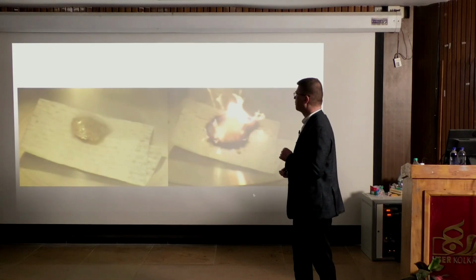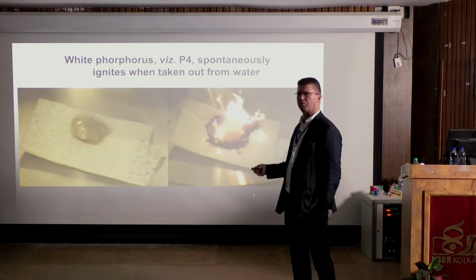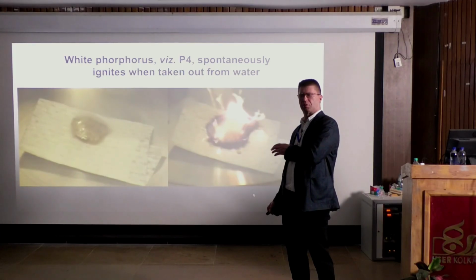So that's the idea of what happens here now. The white phosphorus, which is P4, spontaneously ignites when it's out of water. When it gets dry, it burns. And now, you ask me why. Well, I will show you this.